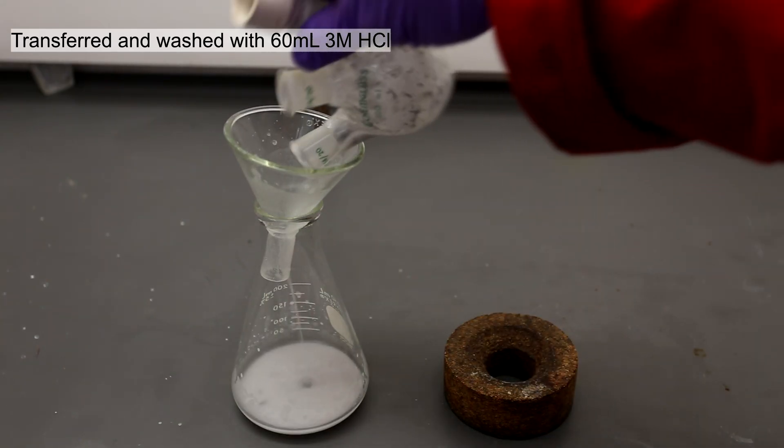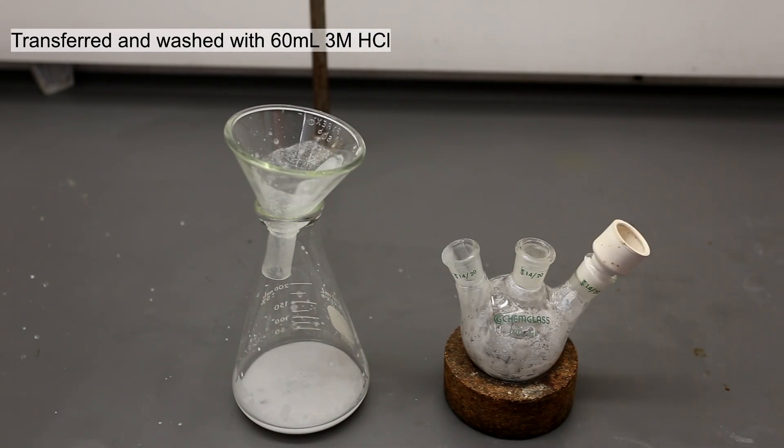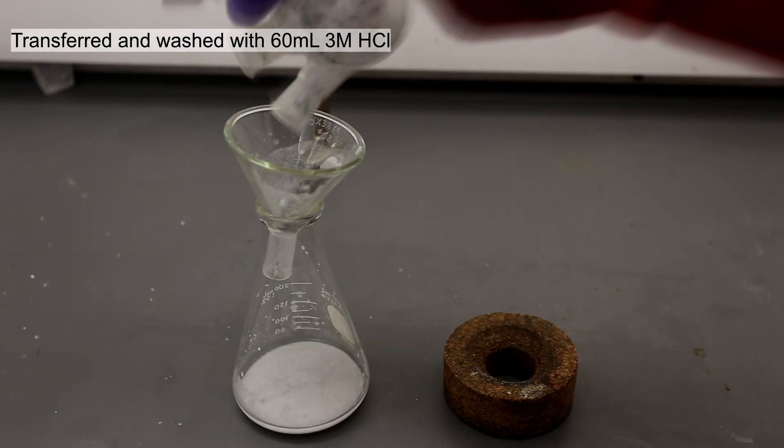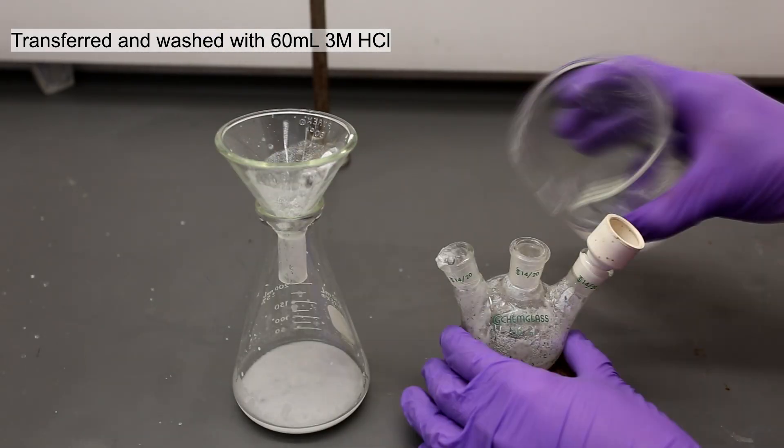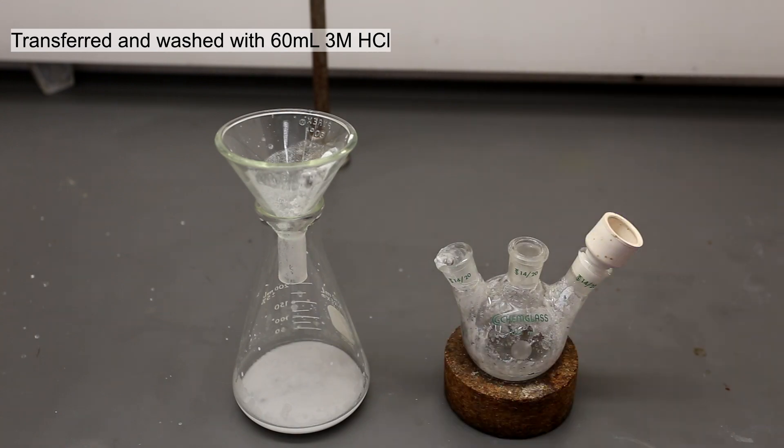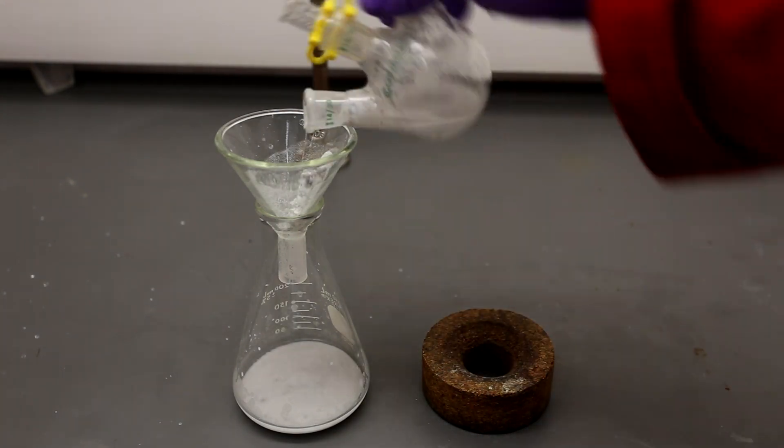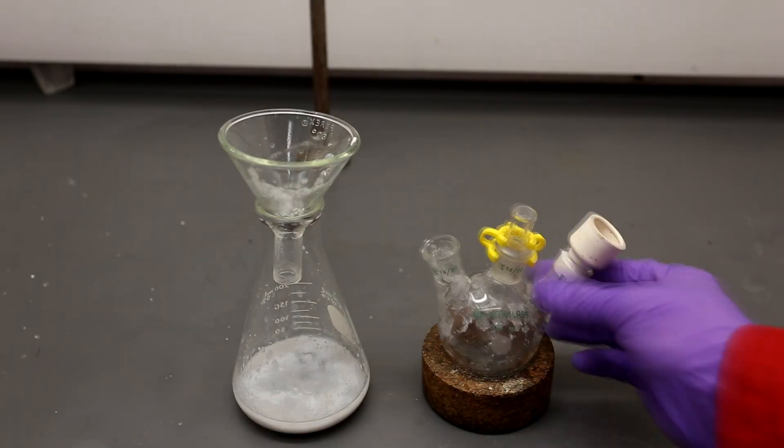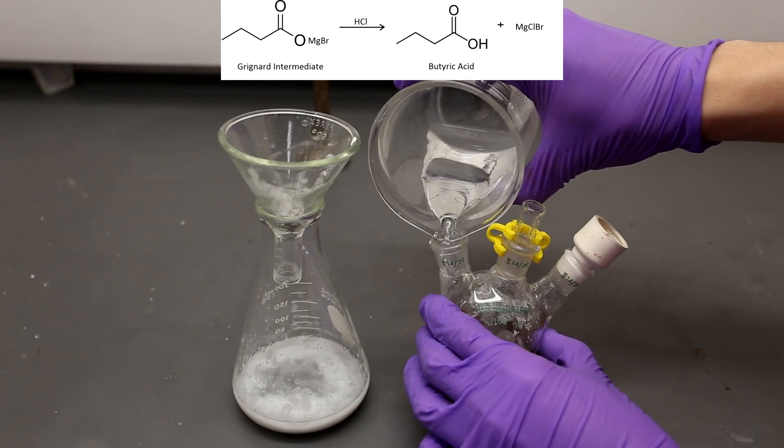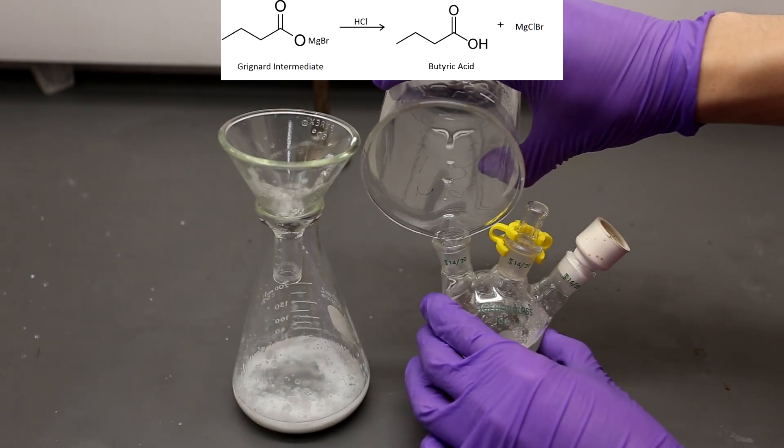The product was transferred to an Erlenmeyer flask and washed several times with a total of 60 milliliters of 3 molar hydrochloric acid. The addition of the hydrochloric acid induces hydrolysis which leads to the formation of our final butyric acid product. The reaction that is taking place is shown above.